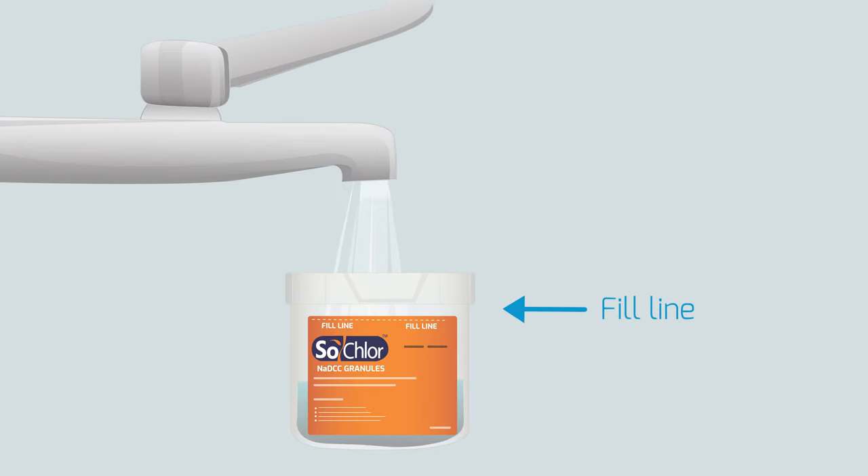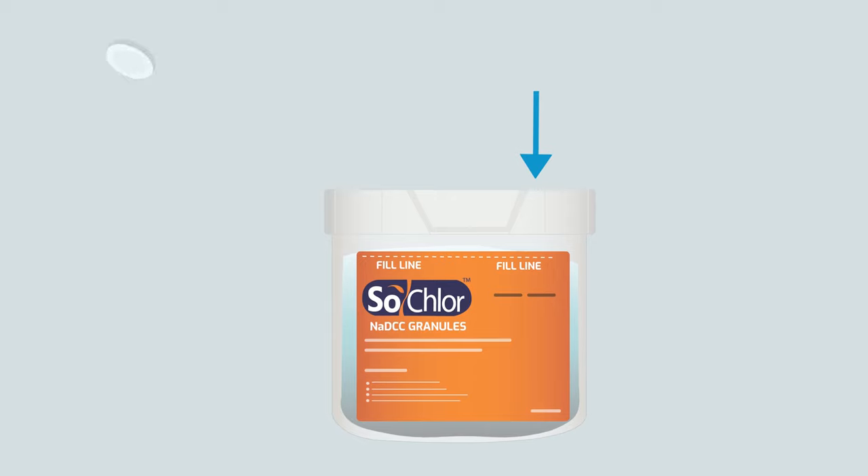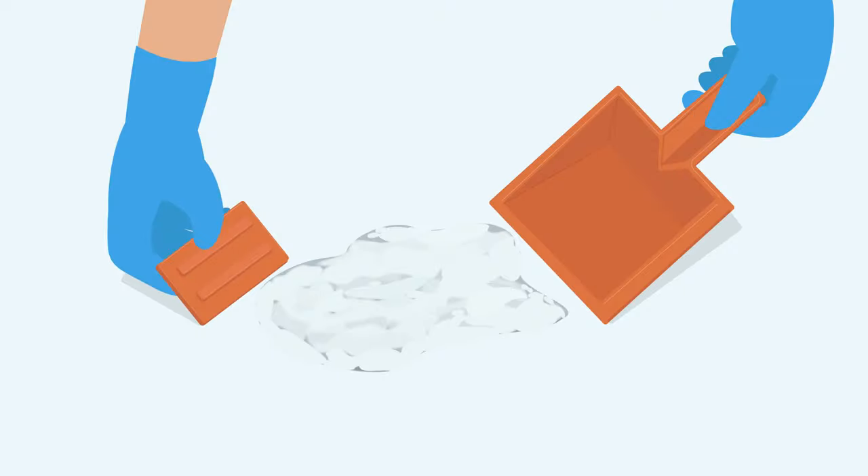Next, fill the empty SoChlor granules container with cold water up to the line shown. Add all the SoChlor tablets provided to the water in the container. Leave to dilute.